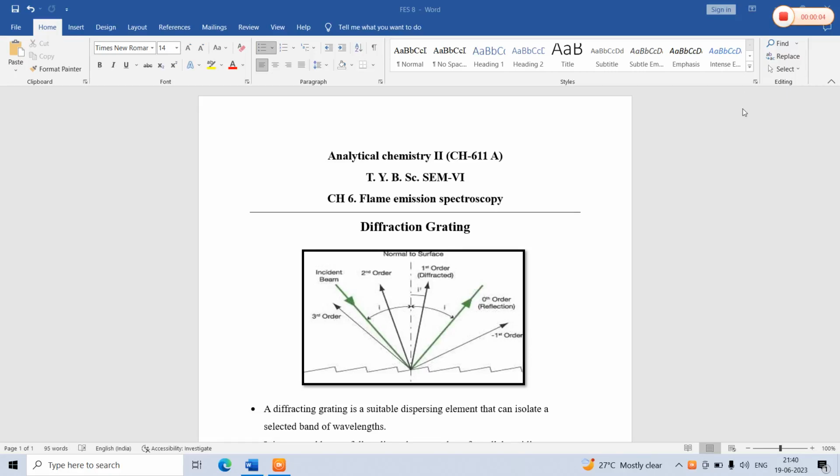Good morning friends. This is a series of lectures for T.Y.B.Sc Analytical Chemistry semester 6 students, and the course is CH611A. The chapter we are going to study is chapter number 6, flame emission spectroscopy, and the part under study is the diffraction grating. So what is the diffraction grating, how does it work, and in which way is the analysis done? Let us see.